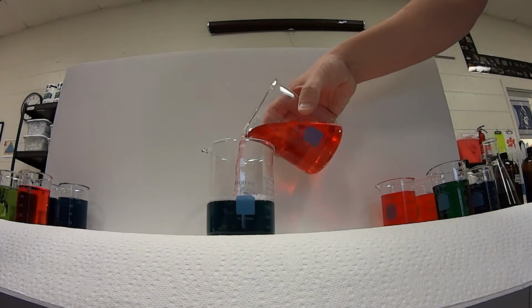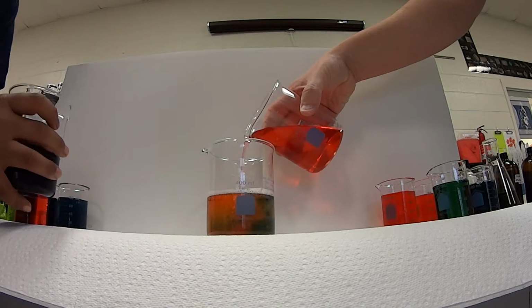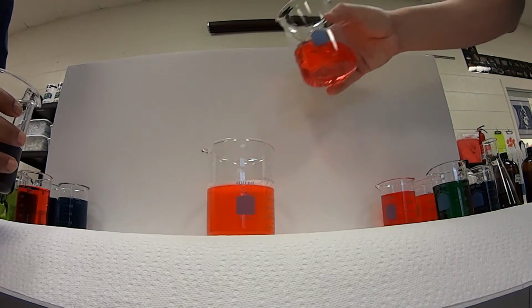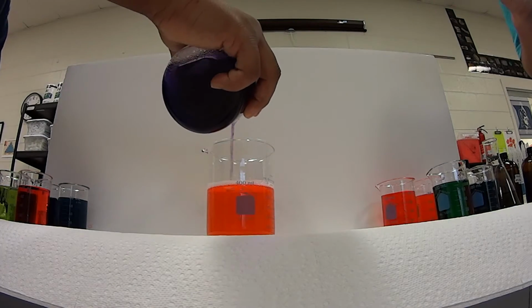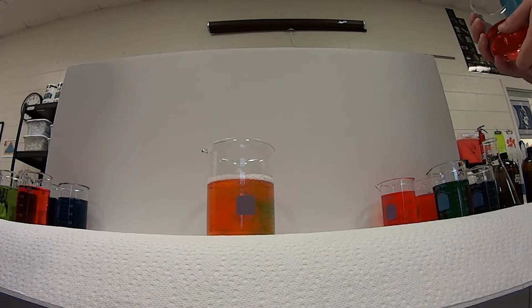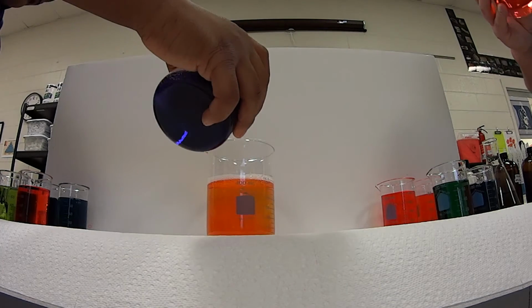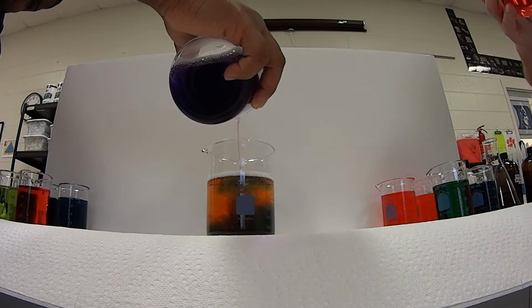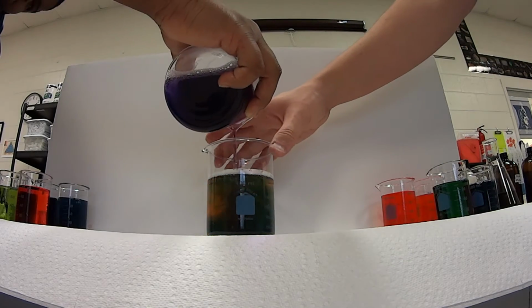And as we add a little more red, you can see it's starting to turn green and then orange and then more of a red. If you add more of the base, okay, it's going to neutralize it, start turning it green. Add just a little bit at a time, see if we can get it a nice green color. Let's try that. That's good.